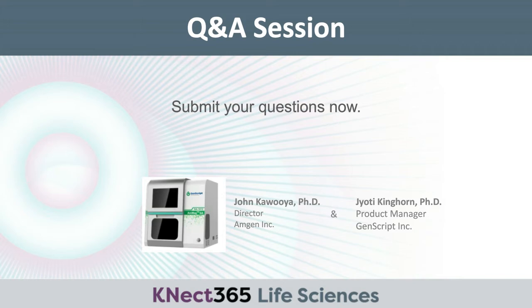Hi, so this is a question for GenScript again. No, you don't have to incubate the beads for 18 to 24 hours. That is only for your convenience, if you wanted to set up the binding step the night before, so you did not have to do that in the morning. However, the recovery is not affected, and you would get the same recovery in a few hours of binding.